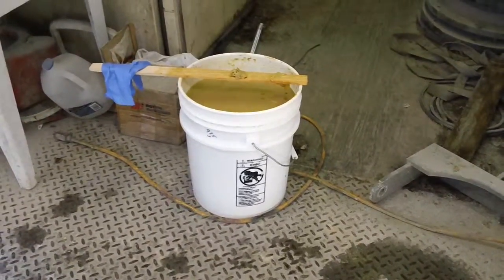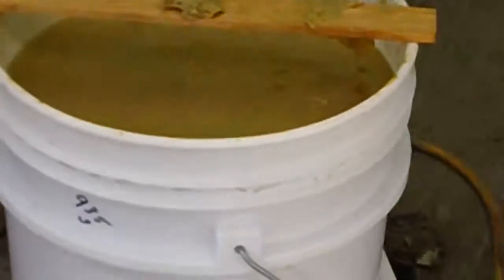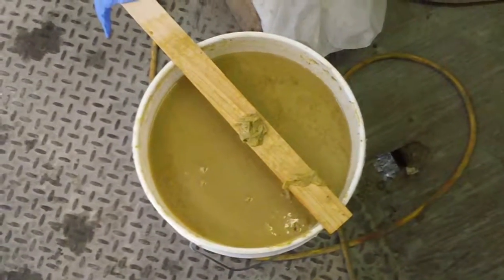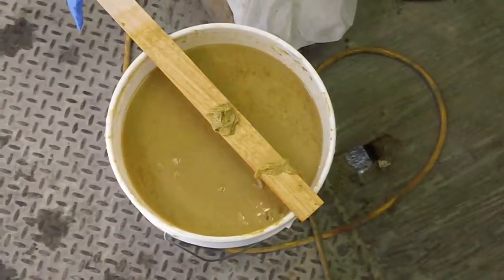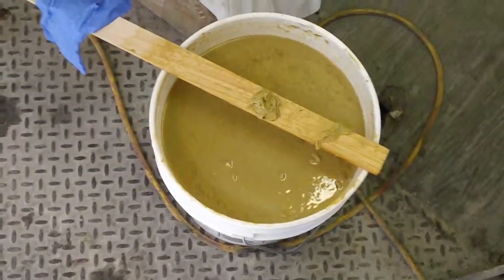Today is Tuesday, October the 22nd, 2013, Vincent Corporation in Tampa, Florida. What we have here is what's been described as fungal material from North American Protein, and apparently it's been stabilized in formaldehyde from what I understand. The sample got here last week while I was traveling, so it's probably been sitting here the better part of a week. The idea is to see what we can do in the way of separation.